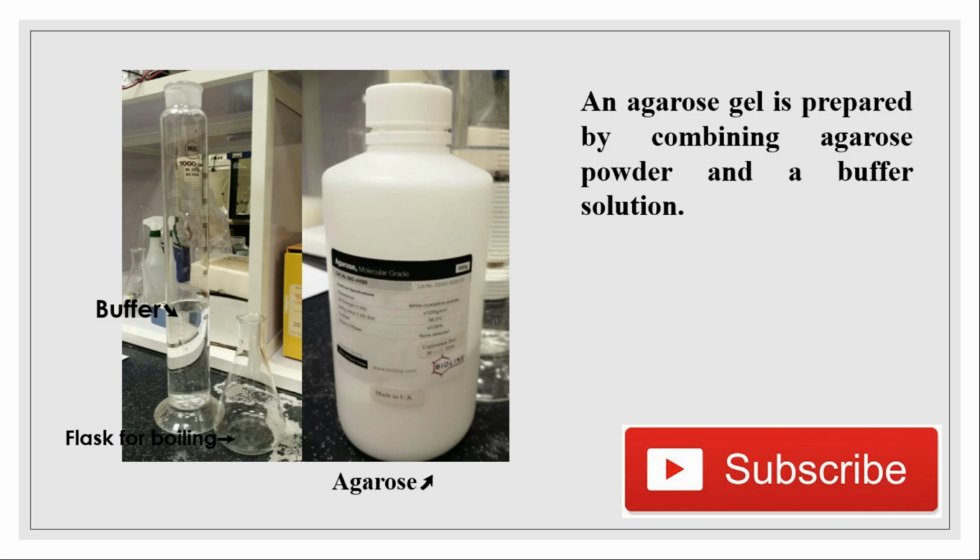While running the gel electrophoresis, you must be sure that the buffer you use to dissolve the agarose is the same as the one in the casting unit. Otherwise, we will have problems, and it will affect the quality of the agarose gel at the end. When we analyze the gel results, the band will not be clear, it will give a faint band, so we should be sure about that.